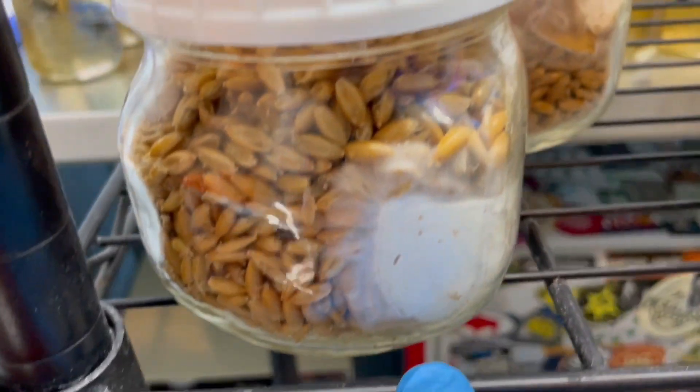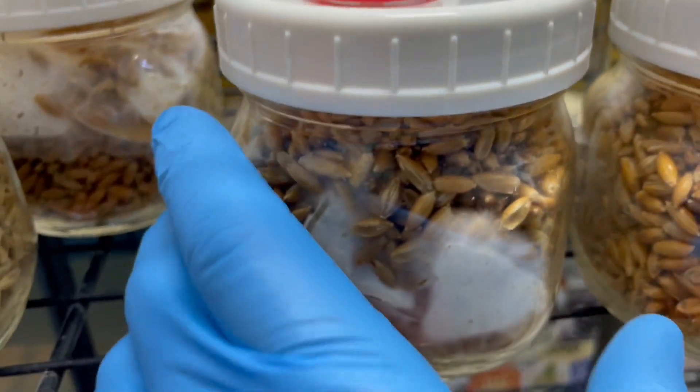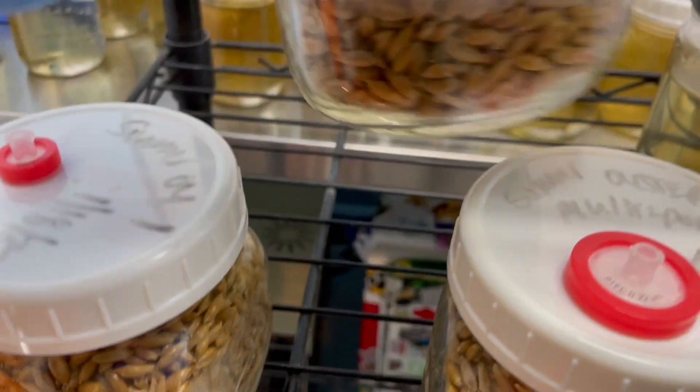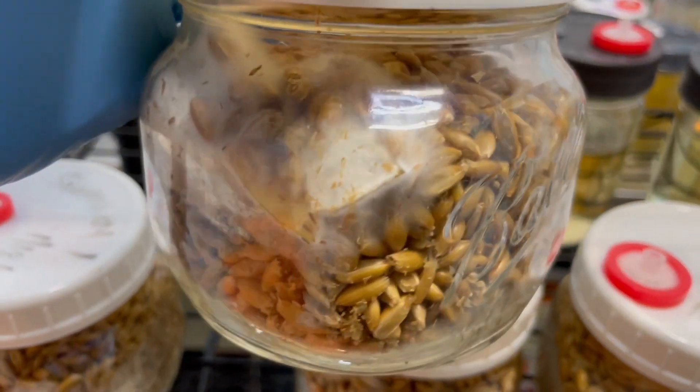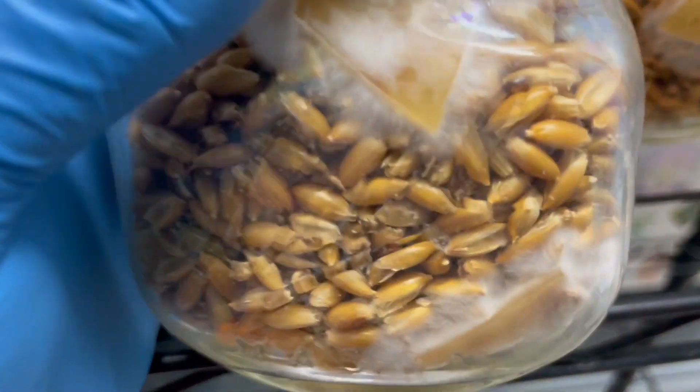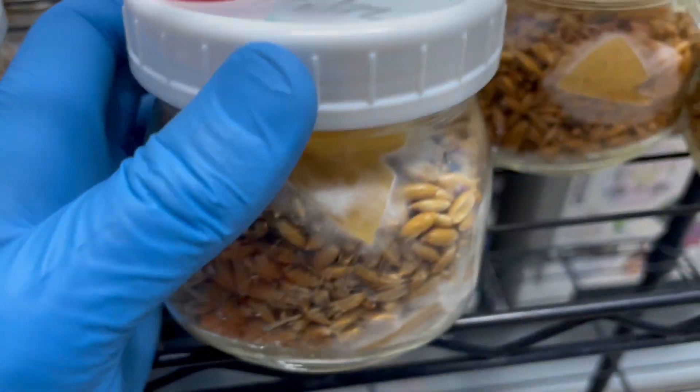We don't see any weird coloration to indicate contamination, so these are looking very healthy. Now we've got our local Colorado summer oysters. These are our golden oysters — really healthy.